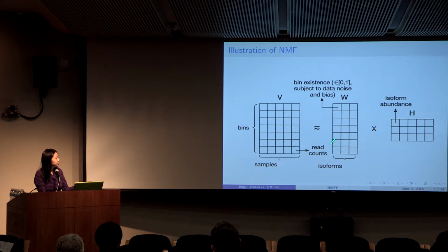Binarized requirements, so we also need to handle this. Another thing is that although we can reduce the number of columns from the number of samples to isoforms, and isoforms are linear combinations of bins, the problem is that these may not be true or valid isoforms. So we also need to take into account when a column has bins that conflict with each other, how do we deal with it? These are all built into the framework here.